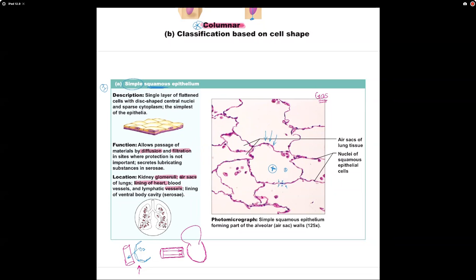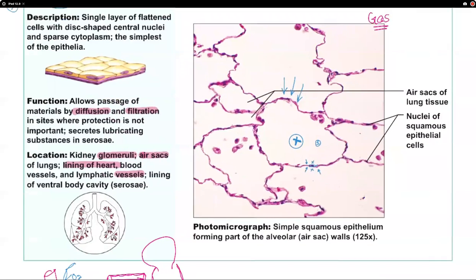The lab exam is going to be diagram based. Maybe you're going to have slides like the ones on here. And the best way for you to be able to identify the tissue is to follow the pattern of identification that we have been following in order to make sure you get the correct answer.